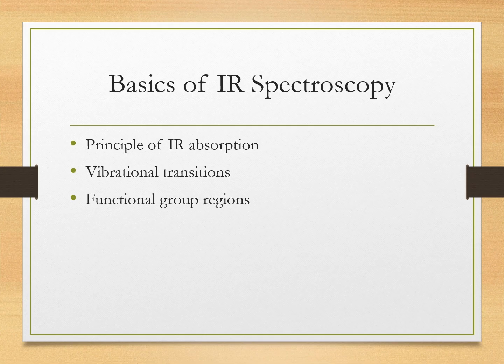Before understanding hydrogen bonding effects, it is important to recall the basics of IR spectroscopy. IR spectroscopy detects the absorption of infrared radiation by molecules, causing vibrational transitions.